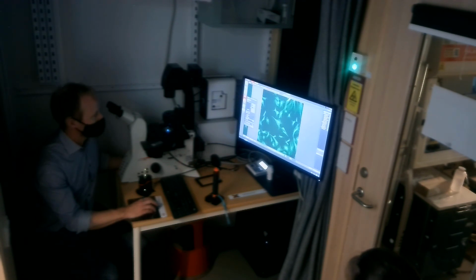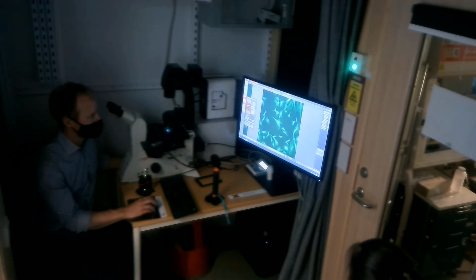So just as before, I can go to the top, say begin, go to the bottom, say end. I have my stack. I have the beginning, the end, where I am right now, the set size. I can drag this into the middle if I want, and I can go through my set stack. System optimized, number of sets, step size, so on. So it's all there.